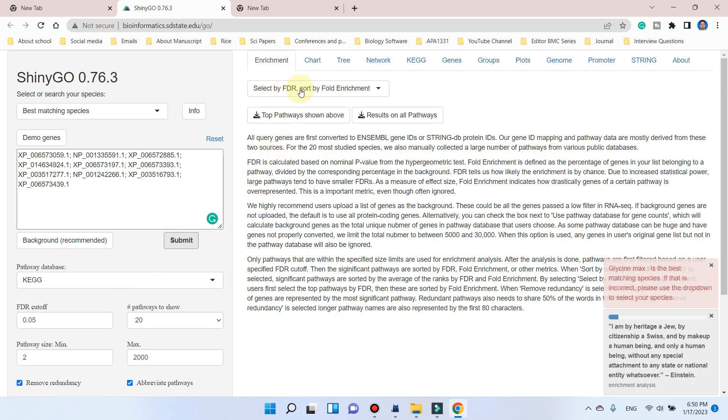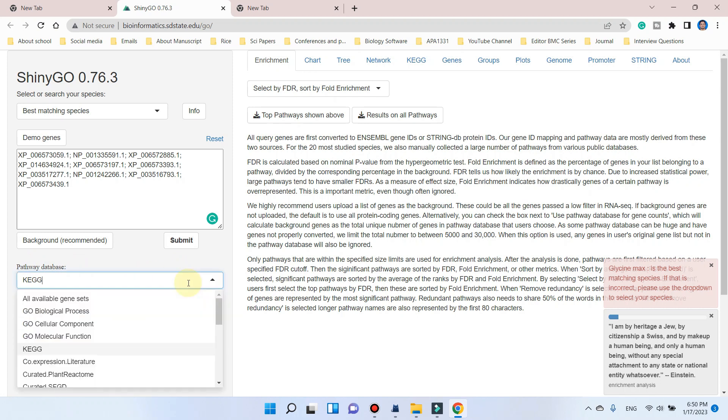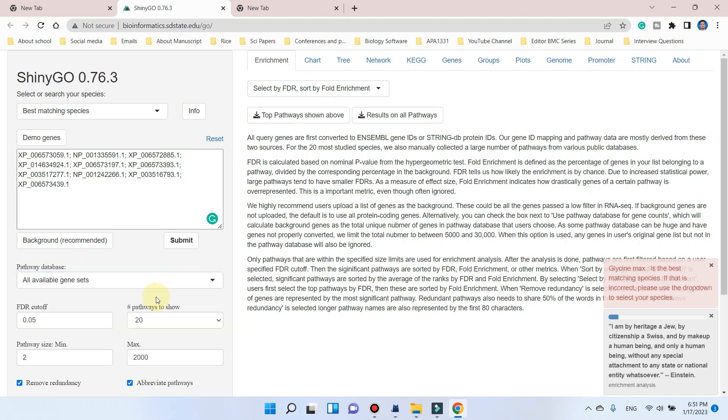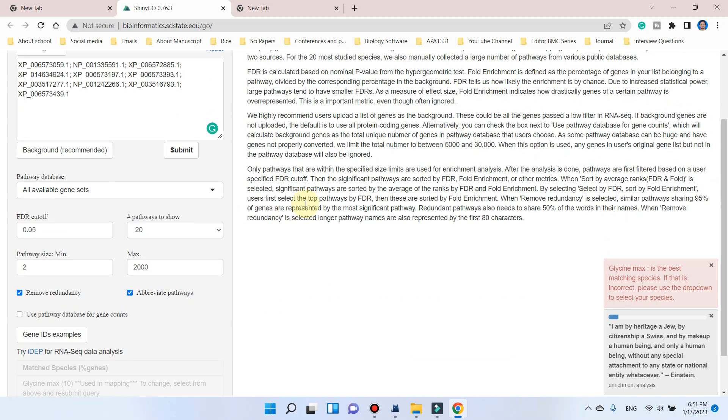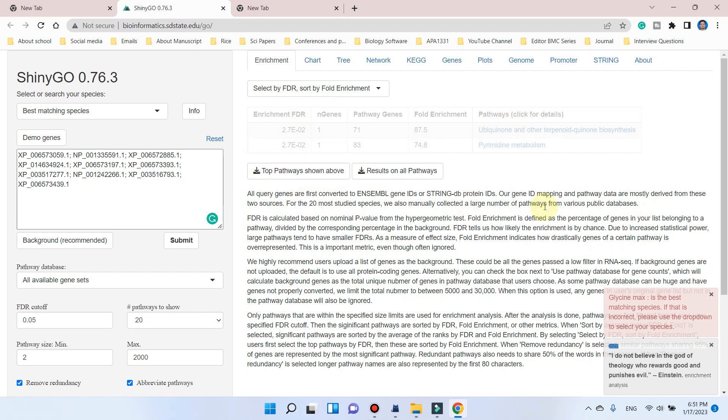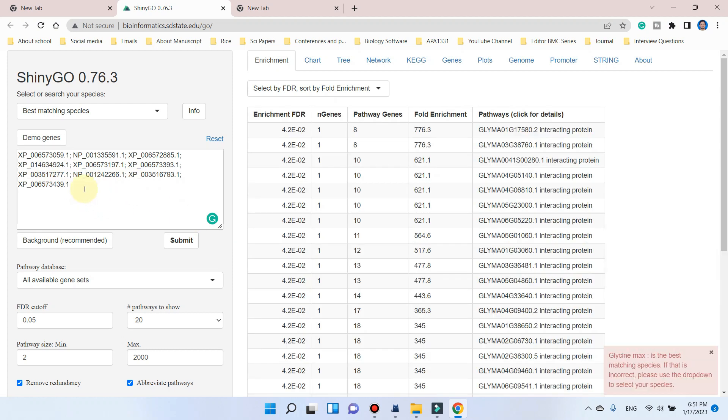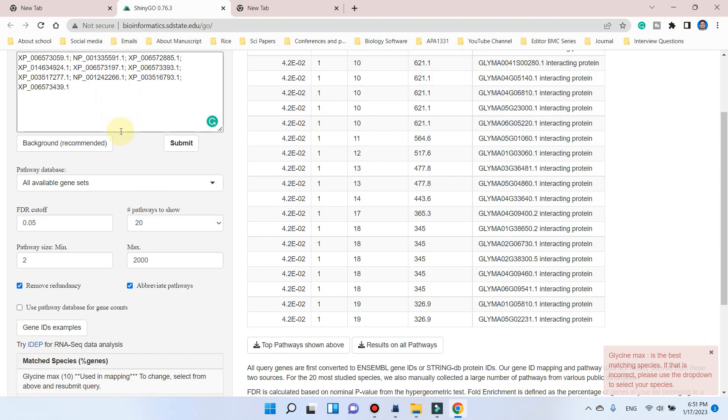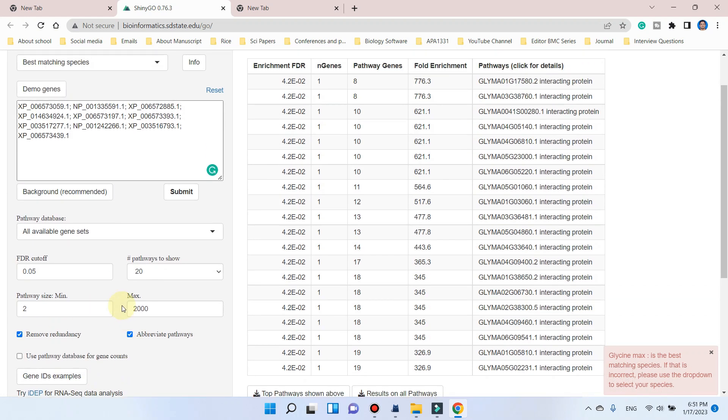And sometimes we can change this pathway database from KEGG to the all gene dataset, so it will give us some results. You can see here, here are some pathways being generated which are related to these gene IDs. It means these IDs are accepted. Hopefully these gene ID examples would help you to know which type of gene IDs are acceptable.